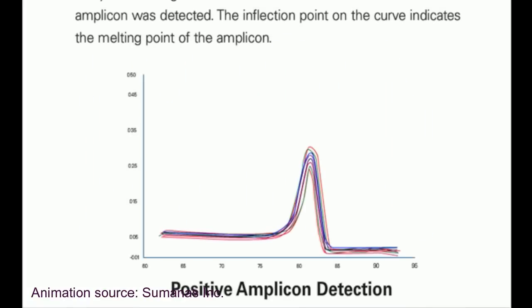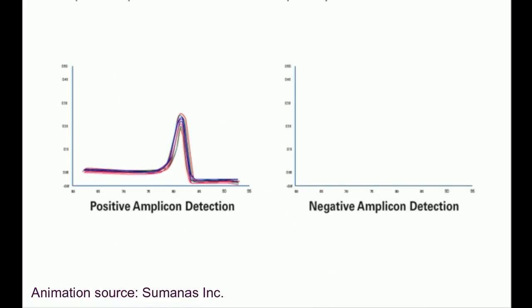For SYBR Green detection, it is important to run a melting curve analysis following real-time PCR to ensure that the desired amplicon was detected. The inflection point on the curve indicates the melting point of the amplicon. Note that contaminating DNA or primer dimers would show up as additional peaks separate from the desired amplicon peak.